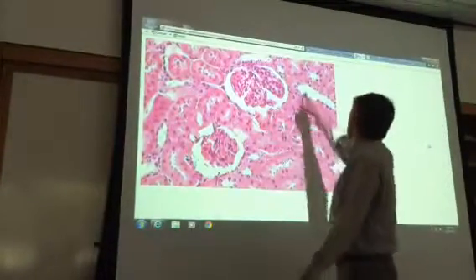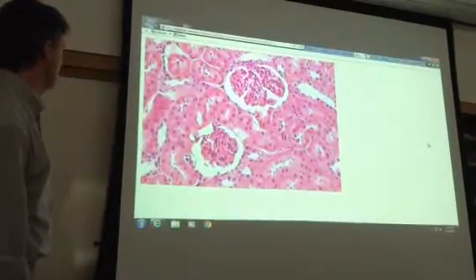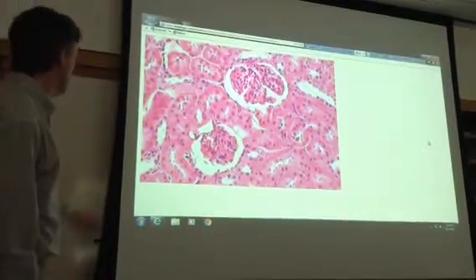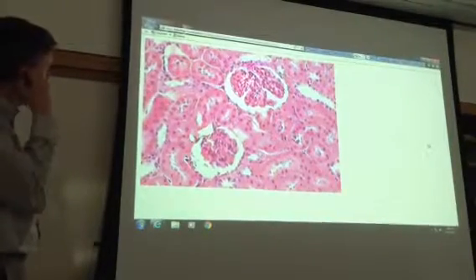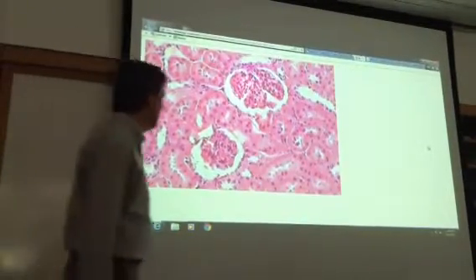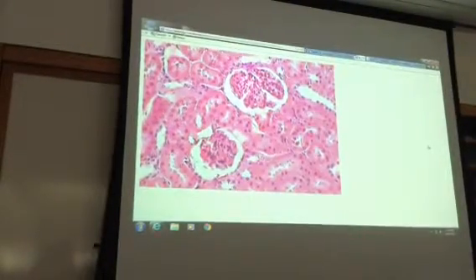So something like that's probably distal convoluted tubule. I don't know. This might be a distal convoluted tubule over here. Most of the stuff though is looking kind of hazy, and it probably would fit into the proximal convoluted tubule. I'll try to give you a good example. I'm not going to pick something that's ambiguous.